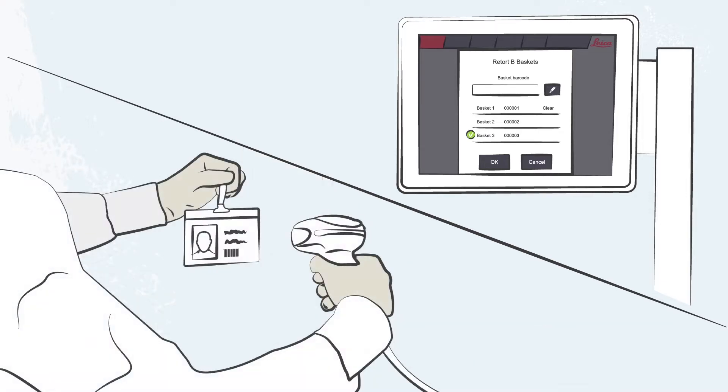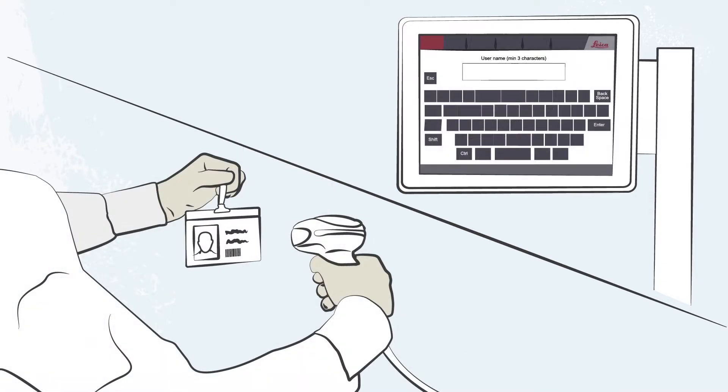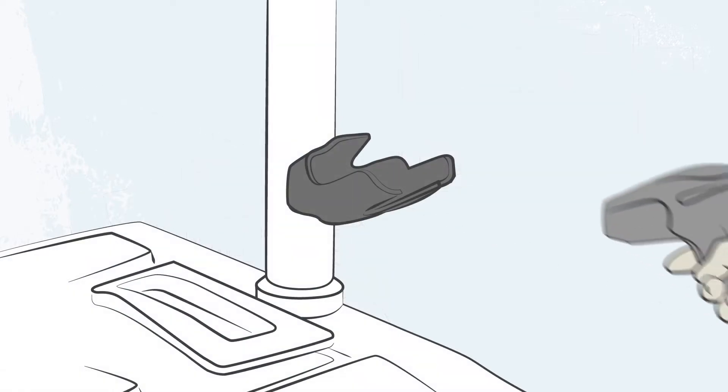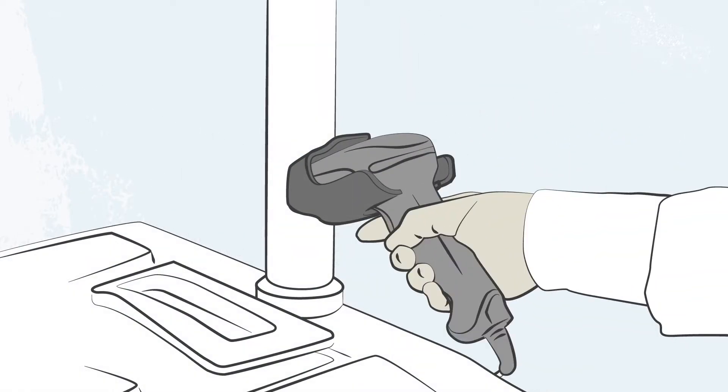Polaris 3 allows Lisa to scan the basket ID and her ID badge using the integrated barcode scanner. This provides traceability of the specimen, linking it to the user and protocol.